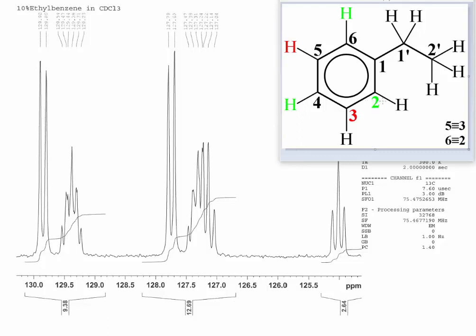So we're able to identify and assign the original peaks according to that. So working from left to right, it would be 3, doublet of doublets, let's see, 2, doublet of quintets, and 4, the doublet of triplets. 3, 2, 4 is the way it goes.